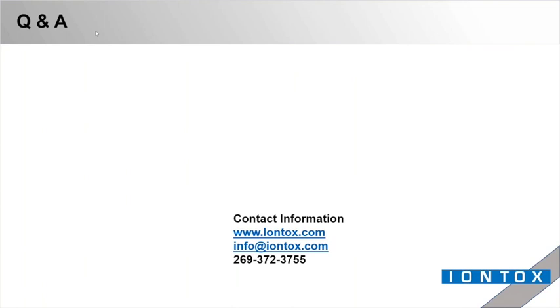The DMSO concentration was less than 0.5%. And another question for you: does the Papp change when you're doing the apparent permeability using the Epithelial? Does the Papp change with the age of the tissues? The whole experiment in this case was done within 3 days of the culture period after we manufacture the tissue. We have looked at different characteristics of the tissue over a 6 week period, and we didn't see any significant change. But we didn't do any drug permeation studies at different time points.